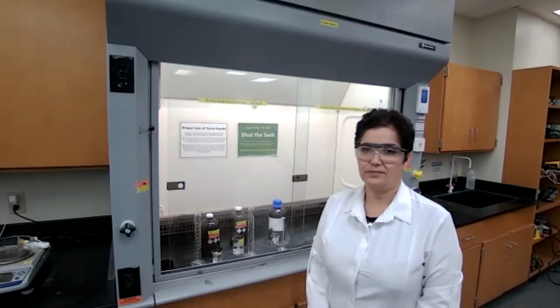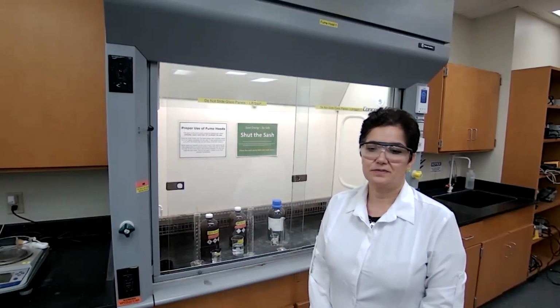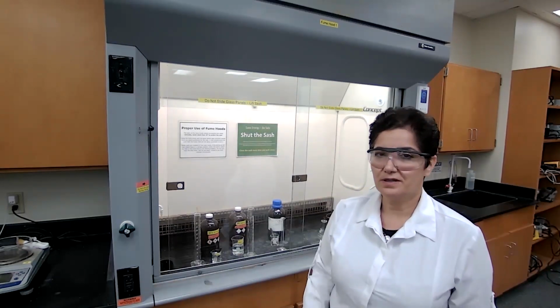Welcome back with a new experiment. Our experiment for today is preparation of dibenzalacetone. The reaction that is used to prepare dibenzalacetone is aldol condensation, or cross-aldol condensation.